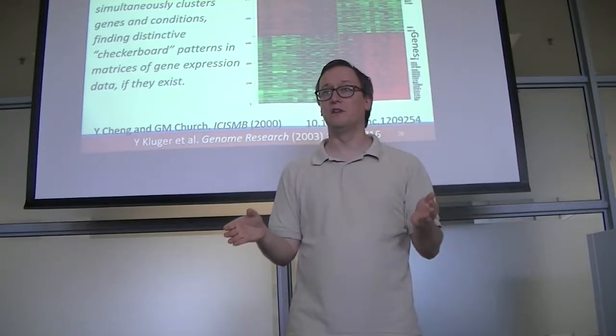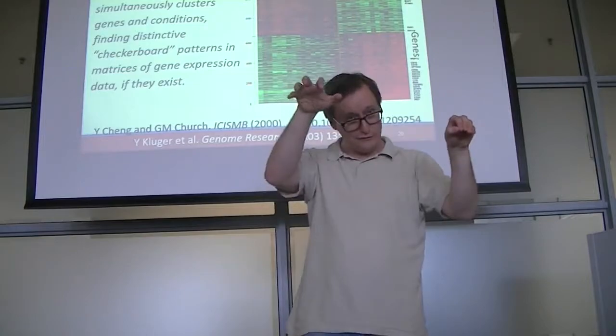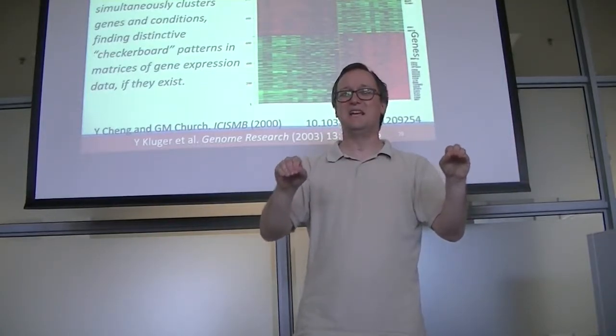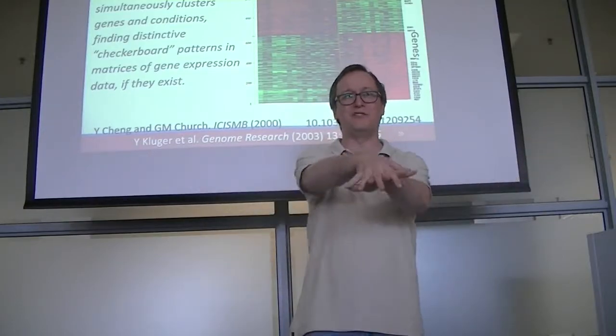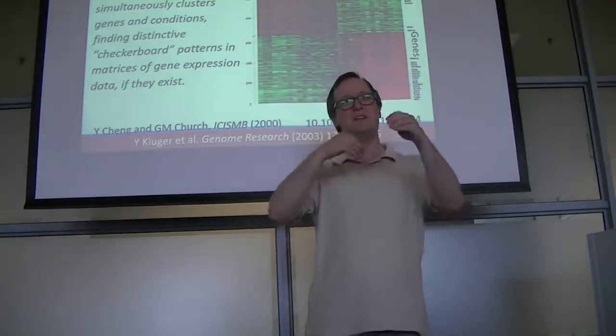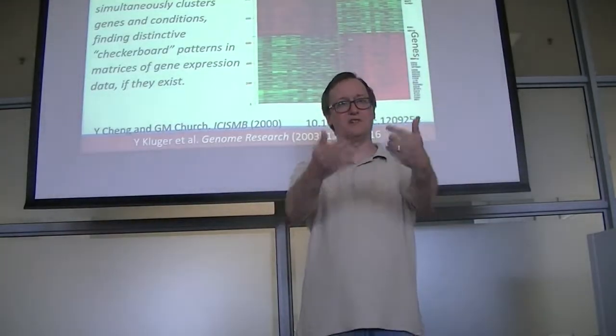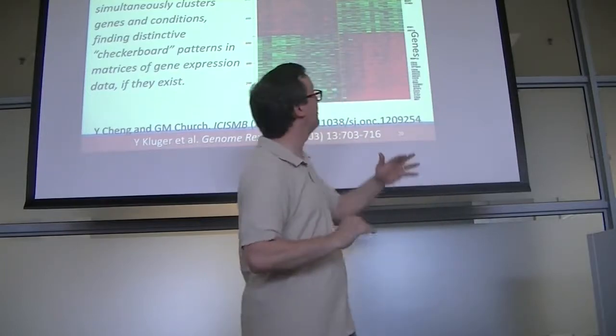Okay. So if you were to do this with a data set where you knew you had only 2 cohorts, you would probably hope that all of your cases clustered together and all of your controls clustered together. If you have just 2 cohorts and you find that their clustering profiles are all intermixed, that's not a great sign for you, right? It means that the comparison you're going to try to do is going to have a lot of commingled effects. So that would be rough.